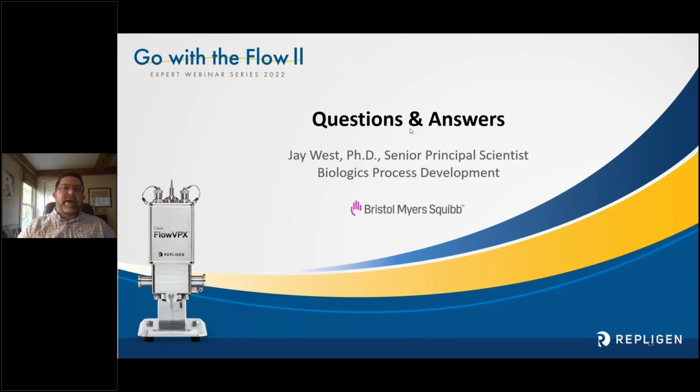In any case, there were 2 instruments purchased for our process development group in 2017, by someone in process development and someone in the pilot lab. So I started working on it at the time because they wanted to know the accuracy of these instruments. So we started doing comparability testing, coming up with ways to do system stability and accuracy testing, and generally taking ownership of the instrument. And then I actually started getting involved in the solo VPE, because that was right around the time that we started working on these higher concentration processes.